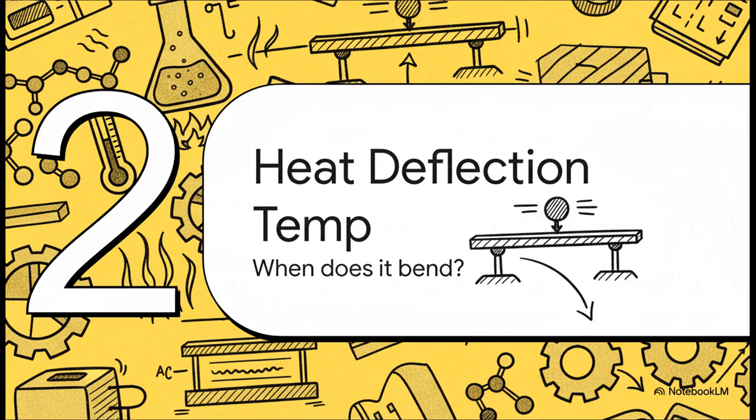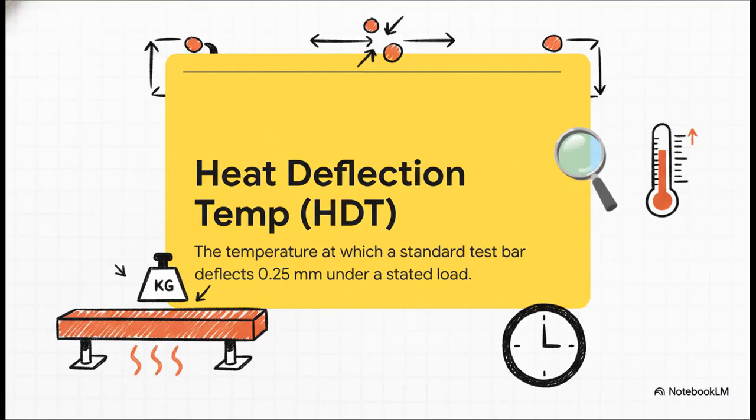Let's head over to our first lab station and see how we can start to build up our understanding of a material's limits. We're kicking things off with the heat deflection temperature test, or HDT for short. This one is all about performance under load. Now, that definition is super specific, and for a good reason. This test basically tells you the maximum service temperature for a plastic part that has to support some kind of weight. See, it's not just about heat, it's about heat and pressure working together. At what exact point does the material just give up and start to deform? That's what we need to know.